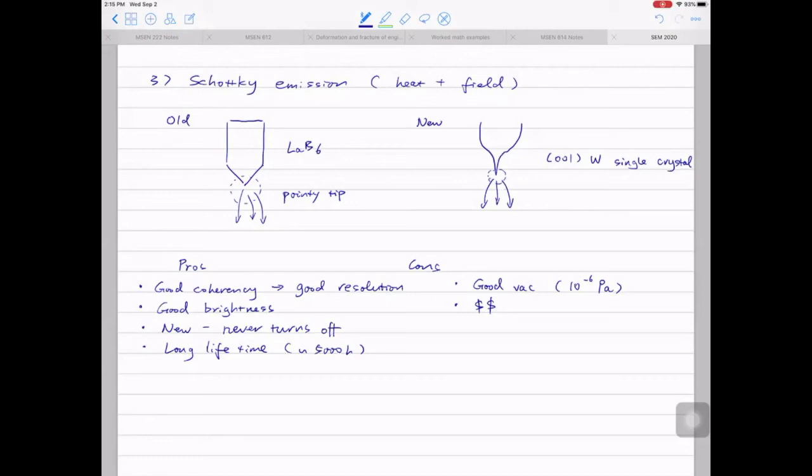It's a combination of pumping systems, so you go down step by step with each pumping system. You're exactly right. The first pump you use is a roughing pump. A roughing pump can help you get to 10 to the minus 2, 10 to the minus 3. Then after that, there are a few designs. You can use a diffusion pump to improve the vacuum to 10 to the minus 5, 10 to the minus 6, or you can use a turbo pump.